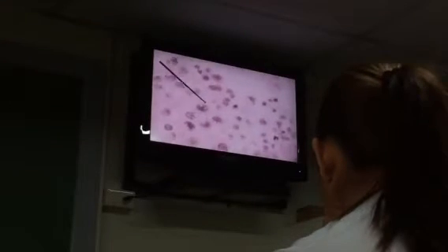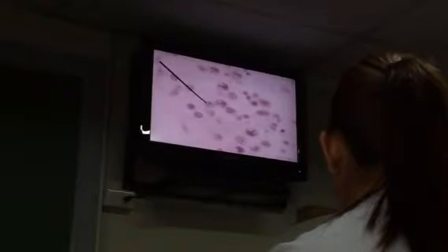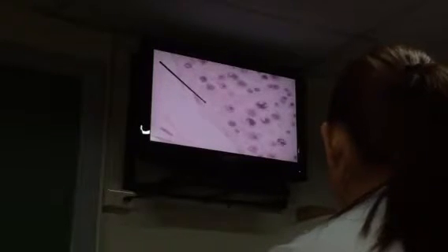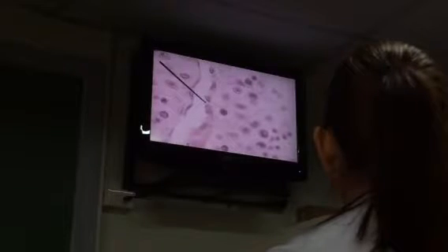Now, the other cell we'd like you to identify is a cell that arises from the basement, going to the lumen. It's irregularly shaped. The clue sometimes is your nucleus. That sometimes difficult to see. Hanap tayo.